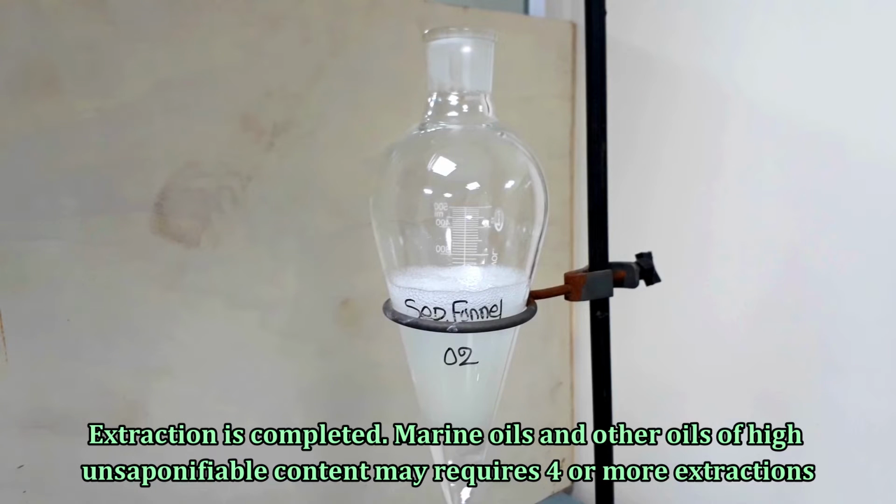Marine oils and other oils of high unsaponifiable content may require 4 or more extractions.